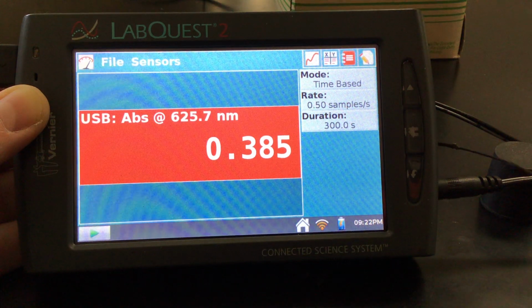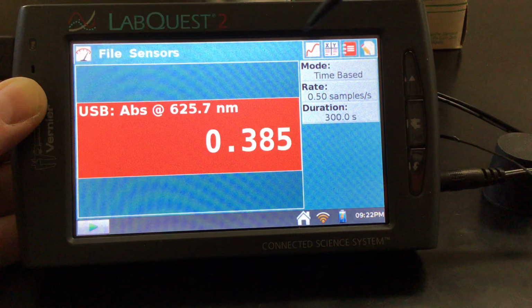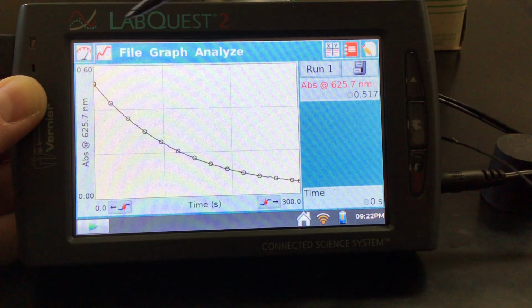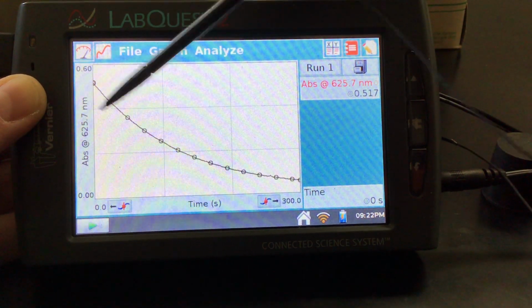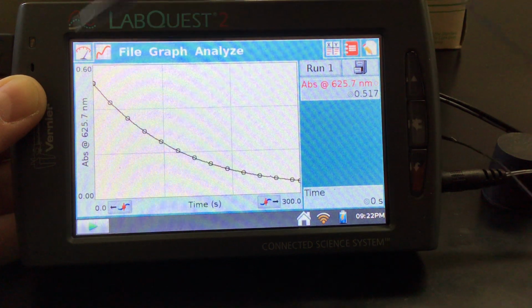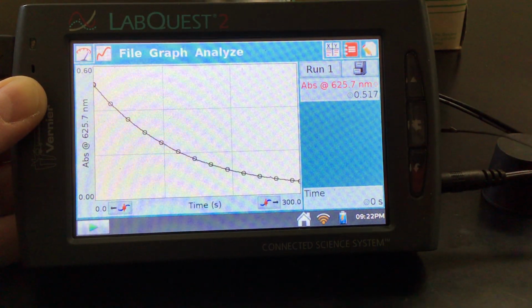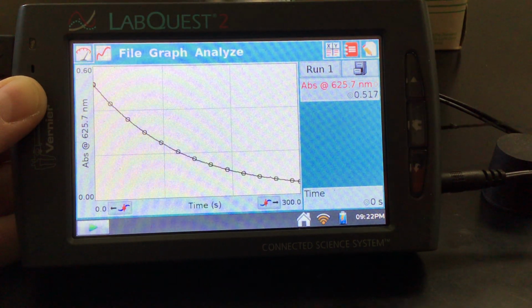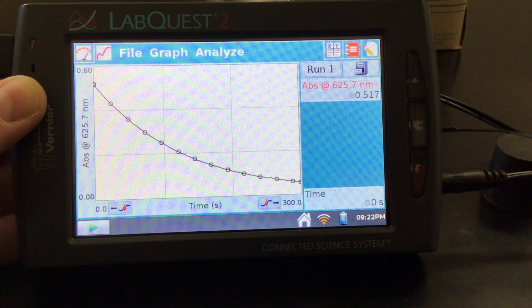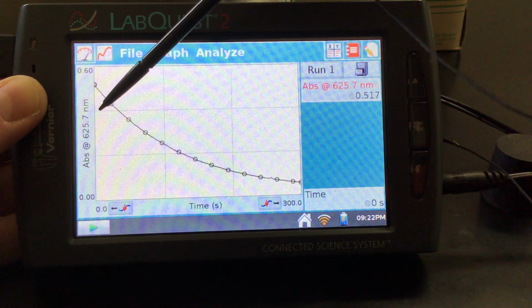Now, I'll show you the data I came up with, so we can learn how to analyze it. Here's my graph. So pretty nice little curve here. This is absorbance versus time. Typically we would be looking at a graph of molarity or concentration versus time. Since we're under 1, we know that the concentration is proportional to absorbance. So even though we're collecting absorbance, we can really think about this in terms of concentration.